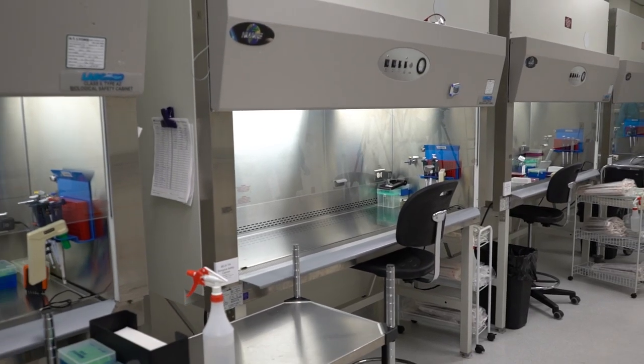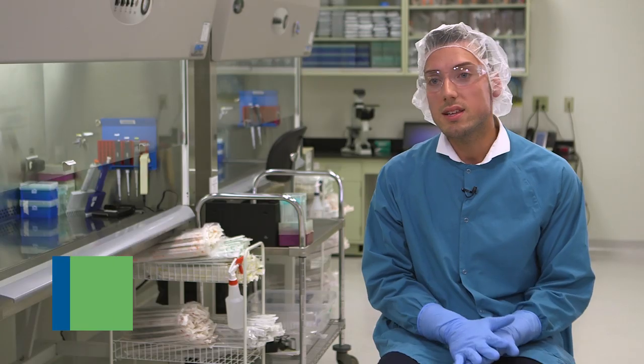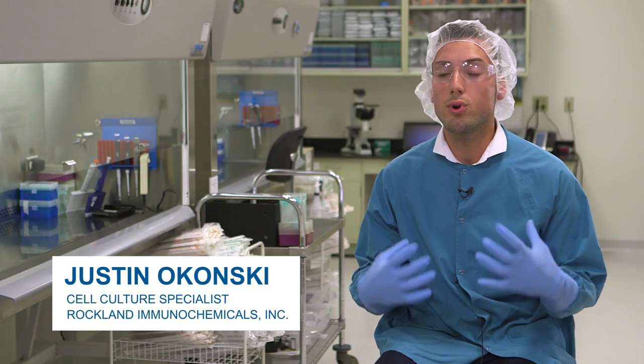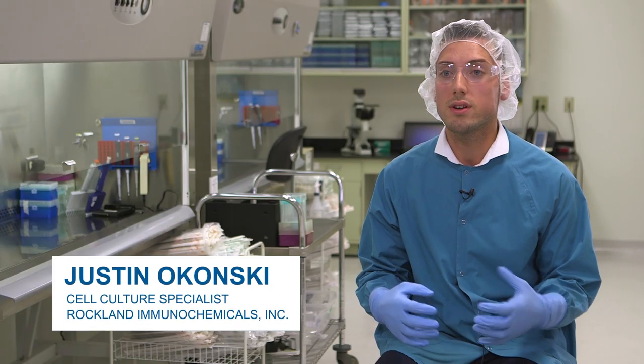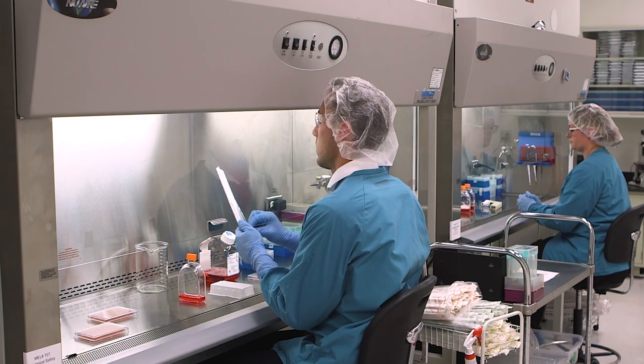So this room is actually dedicated to our monoclonal antibody development. Our testing techniques involve proving reactivity of a clone towards an assay. That assay we use is ELISA, which is governed by strict SOPs and strict protocols.